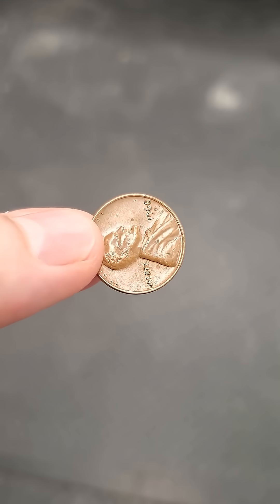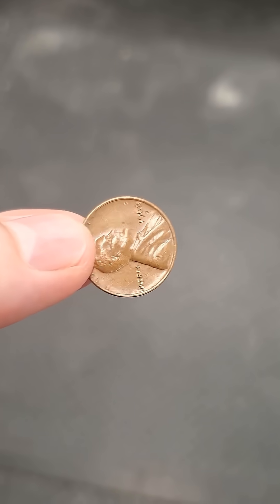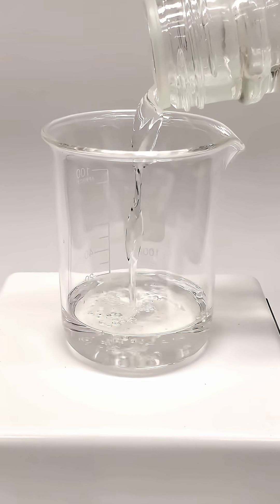So today, I'm going to be destroying this poor penny for no reason. To do this, I just need to add some nitric acid to a beaker.